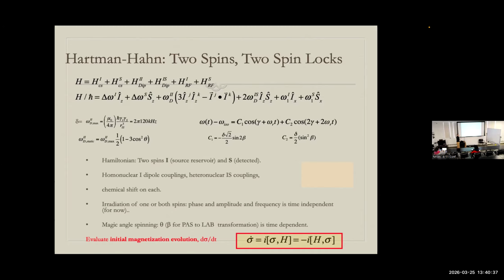So here's the heteronuclear. So I cut it off to IZS. Okay. Now, I already said I want to work with this. Where is my heteronuclear? Yeah, IZSC. And then I pointed at this and said some nonsense. This is RF on spin I and RF on spin S. Okay? So this is the only piece I'm trying to get anything out. This is the guy. Okay? This is my tool to erase all of this somehow.